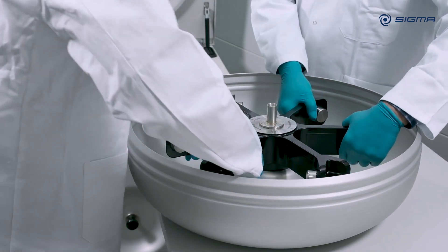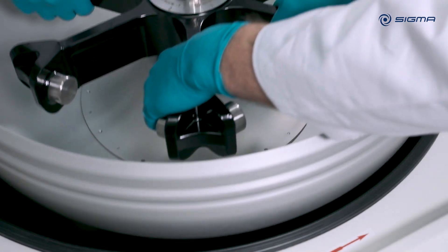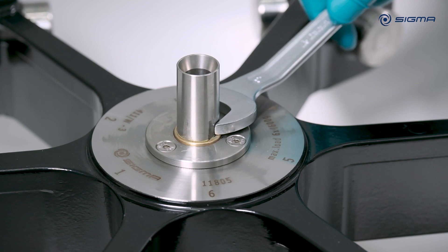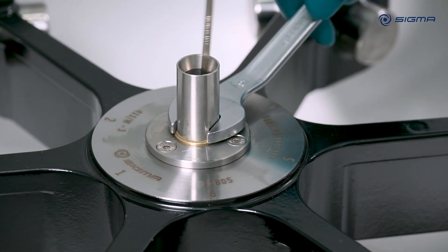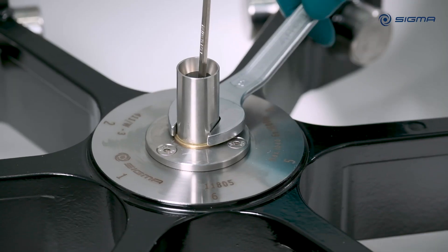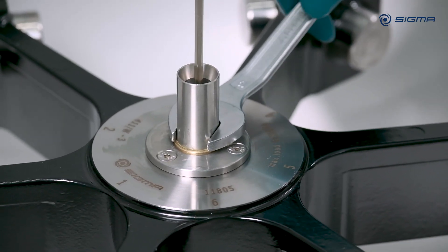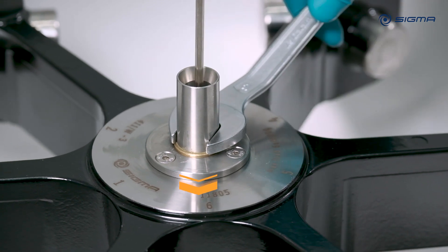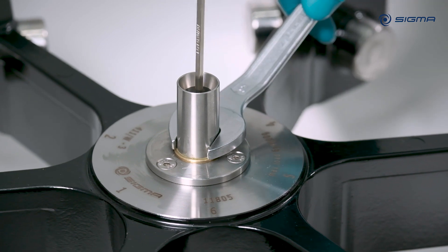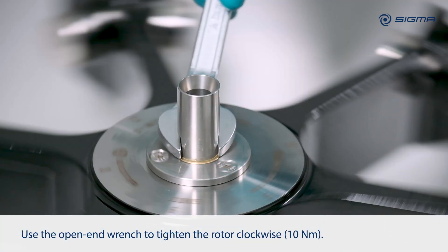Carefully lift the rotor into the centrifuge chamber to avoid damage to the threads. Hold the rotor securely with the open end wrench and turn the allen key counterclockwise to the left until the rotor settles by about one centimeter. When the rotor is fully seated, tighten the rotor clockwise using the open end wrench.